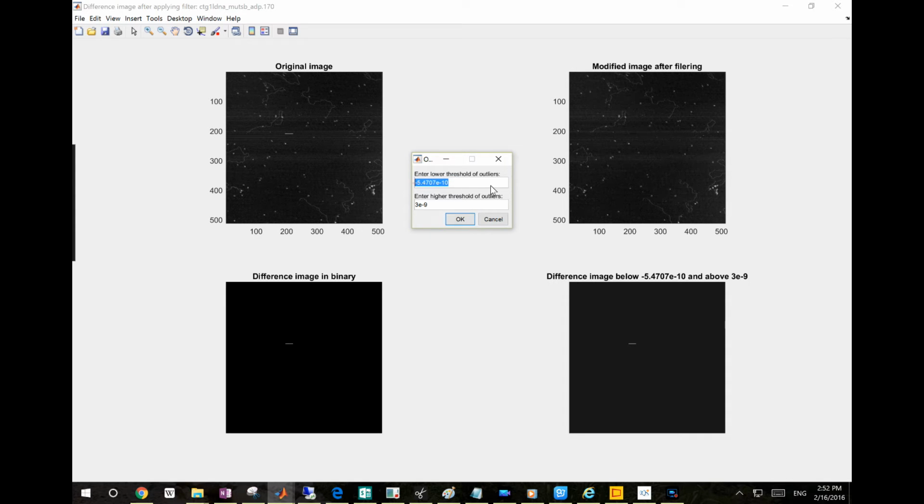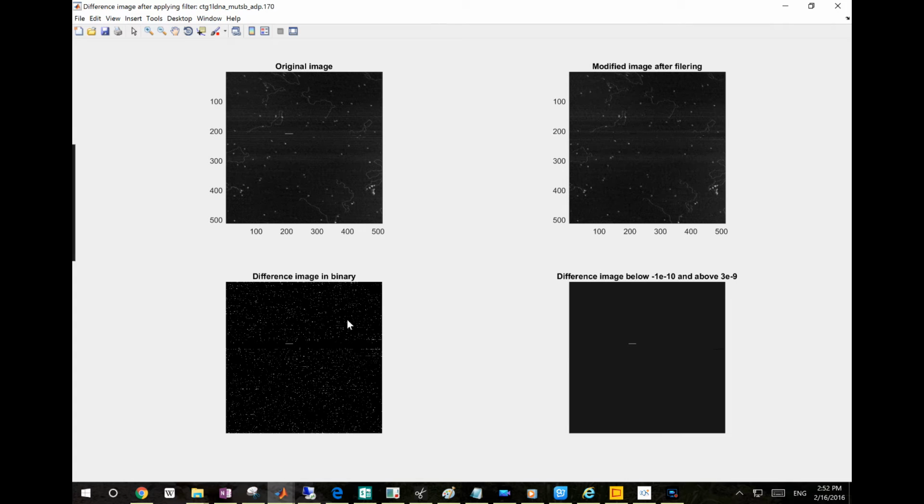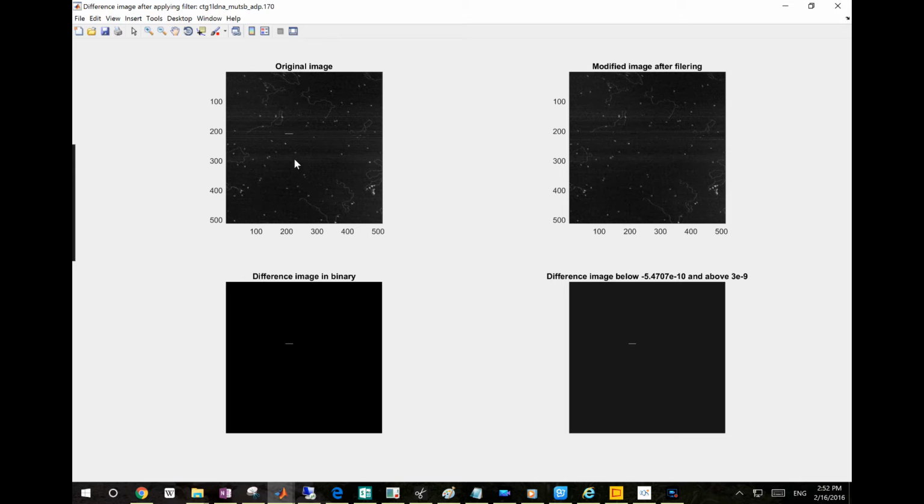So to correct for those dark lines, you have to use the lower threshold. Right now I'm going to use, let's say, this one. See how it goes. Apparently it does something, but it's mostly correcting useful data, not those lines. I don't think they're corrected at all. So I think that's a mistake. I guess this won't work well. So for now, I'm only going to correct for the higher threshold, which is the line artifacts there.